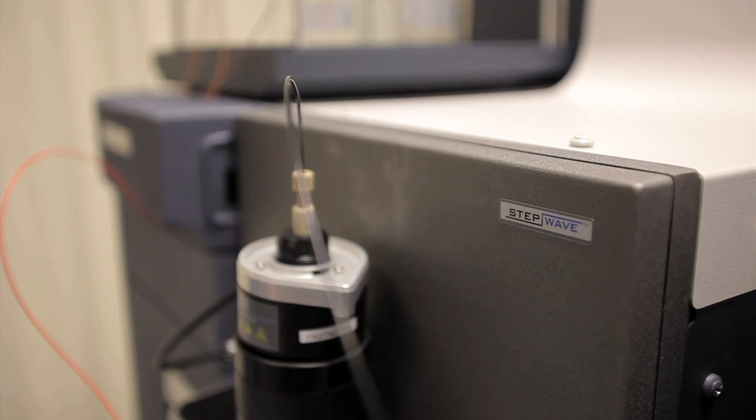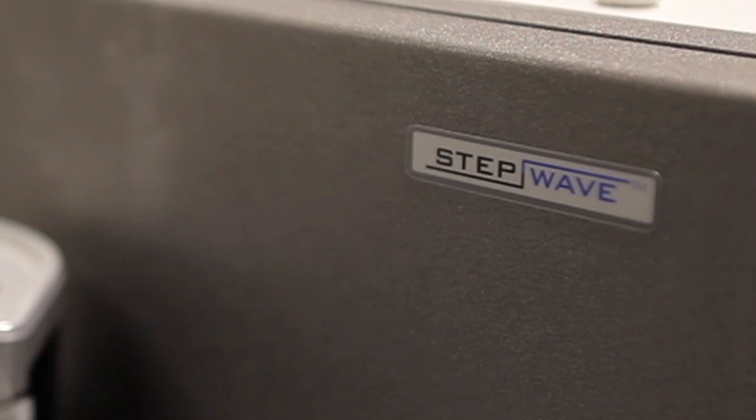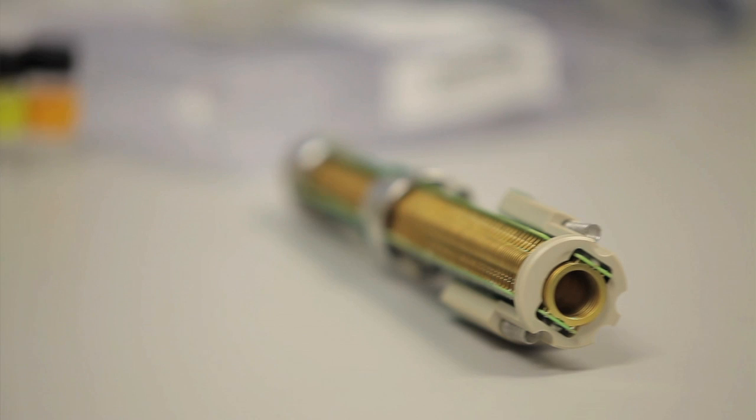I'm going to talk to you about the step wave technology, which I've been involved in the design of right from its inception through to implementation on our current instruments. Of the many attributes of a mass spectrometry system, sensitivity is one of the key parameters and this is constantly something we focus on improving. But increasing the sensitivity alone without improving the robustness of the system leads to a solution that's not really practical.